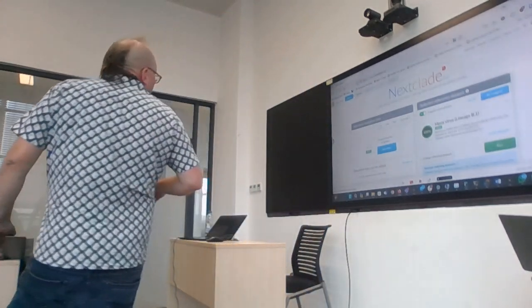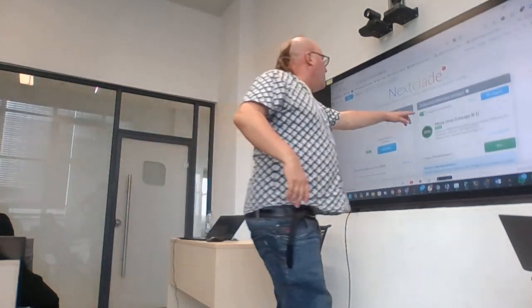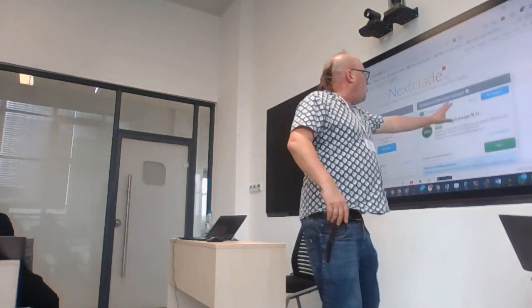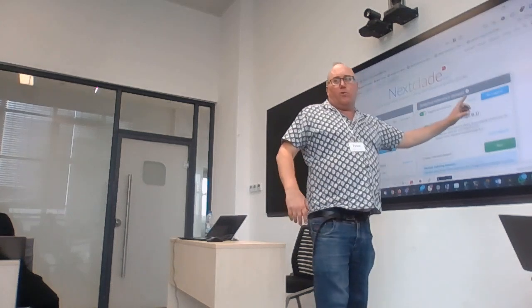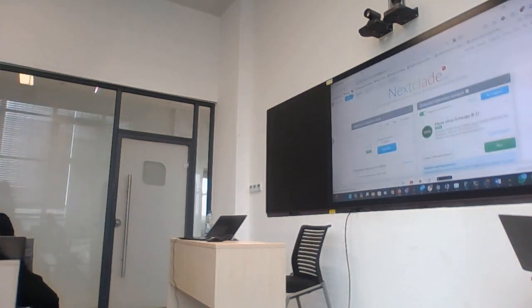And then on this side, it's which reference dataset should I use? Nextclade has a nice feature these days. It will try and guess which is the correct reference to use in your analysis. It will look for which reference is similar to your consensus sequence. So if you've got a clade 1, it will recommend a clade 1, etc.